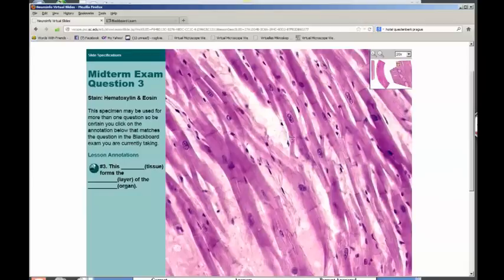I see that because they're like strings or wide strings, and there are nuclei, and the nuclei are in the center of these stained strands. And I can see here there's communication between this strand and this strand, and then I see these interesting structures here that are denser. So these are intercalated discs, and that's a nucleus in the middle of a striated cardiac muscle cell, or you could also say cardiac myocyte.